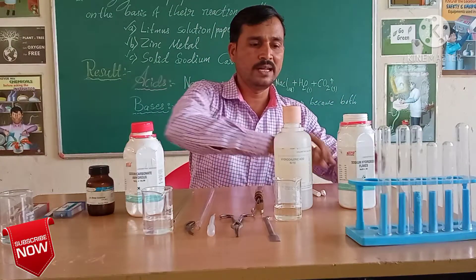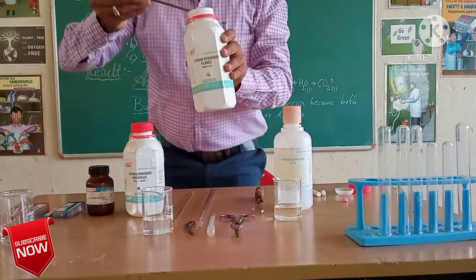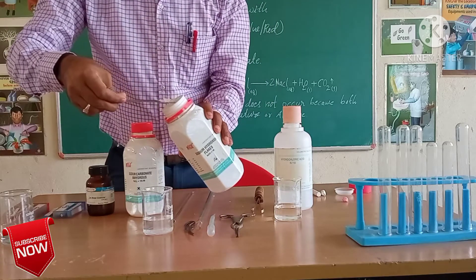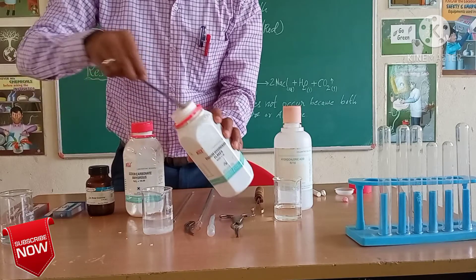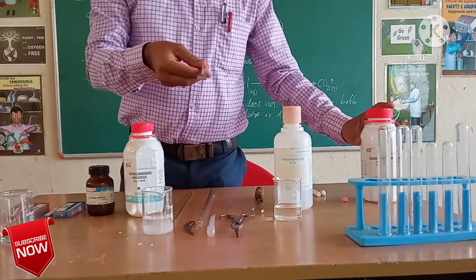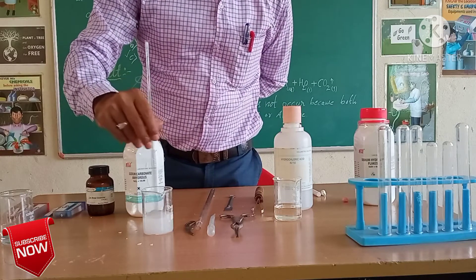We will add little flakes of sodium hydroxide. Already I removed the lid to make it easy. I will take little flakes of sodium hydroxide with the spatula and add them with distilled water. Stir it with the help of a glass rod to prepare a fine basic solution of sodium hydroxide.